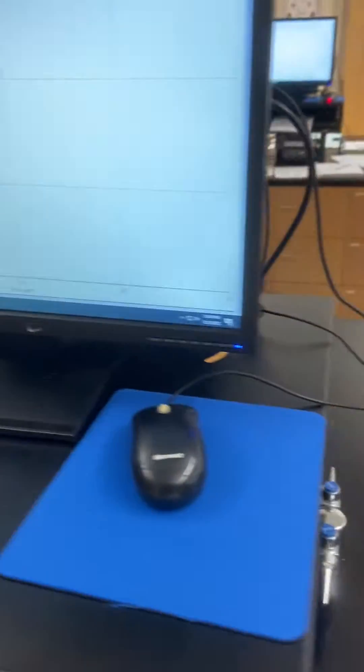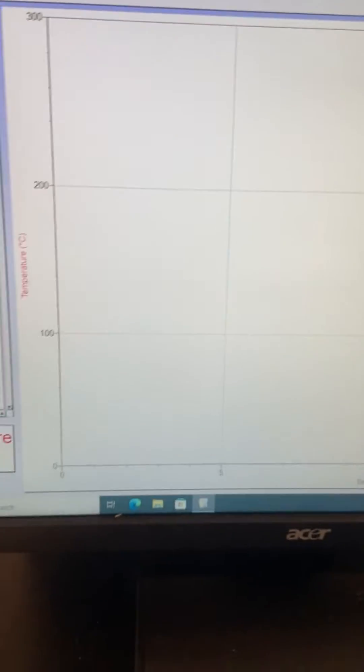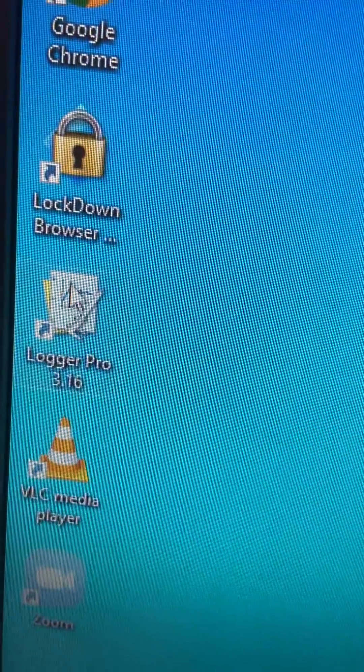On the PC, we have a program called Logger Pro. It's on the desktop over here.